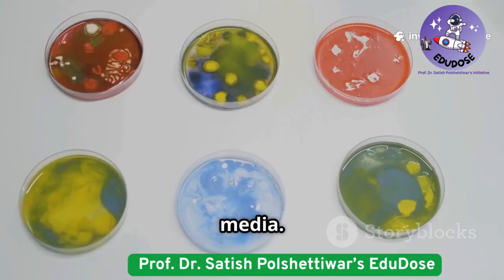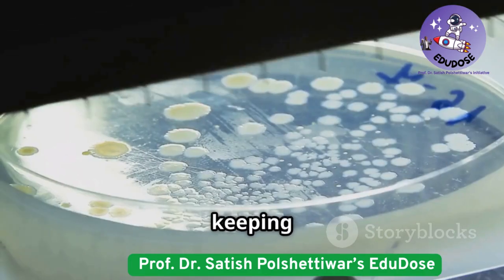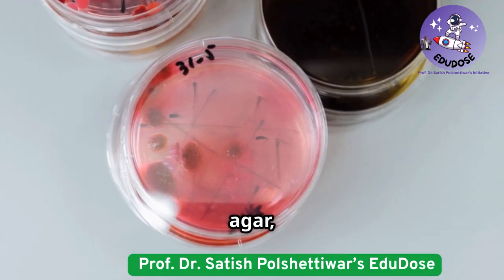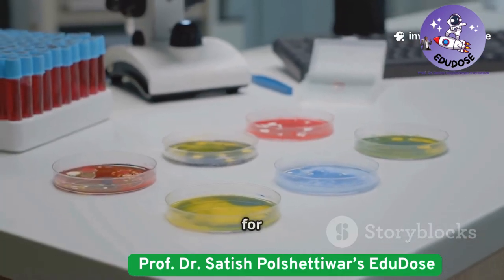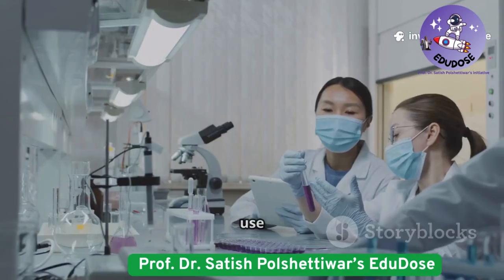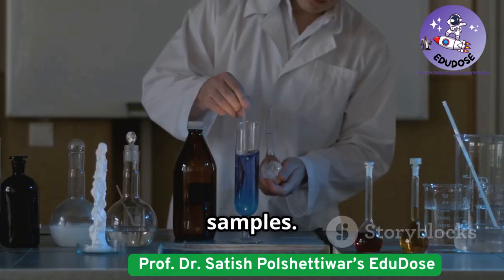Next, selective media. This kind of media encourages only certain microbes to grow while keeping others out. MacConkey agar, for example, selects for gram-negative bacteria, and mannitol salt agar is great for Staphylococcus species. We use these for things like detecting foodborne pathogens, water testing, or clinical samples.